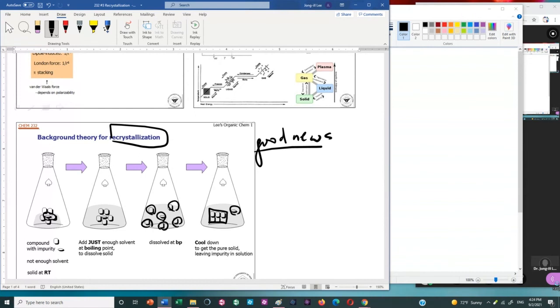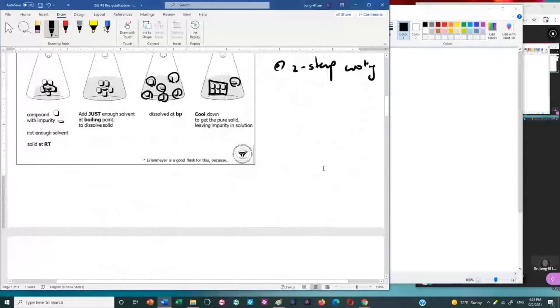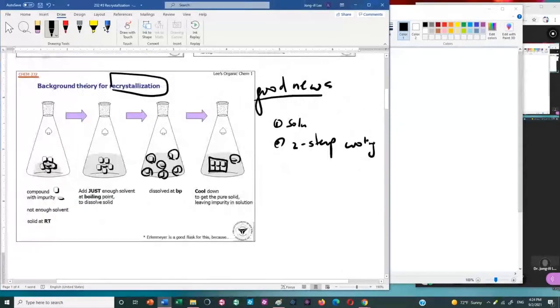So how do you do that? That's when you need a couple of factors. Let's talk about solubility factors first, then two-step cooling. So solubility, we can go quickly because we already talked about it. Our presenters, the speakers, told us today.